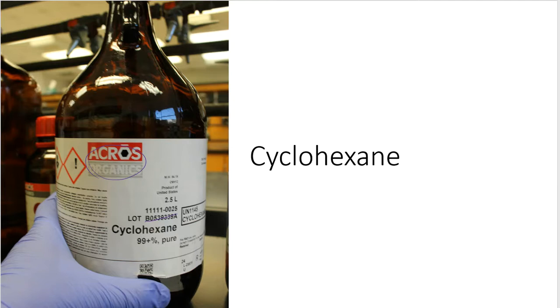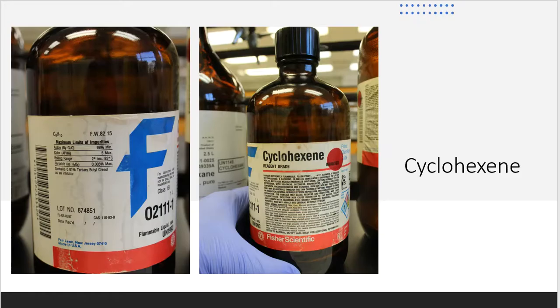Well, it's not over yet, folks. I also need cyclohexene. Again, you should be able to draw that one without a problem. Cyclohexene is also from Fisher Scientific, and the lot number here is 874851. Well, we keep going.